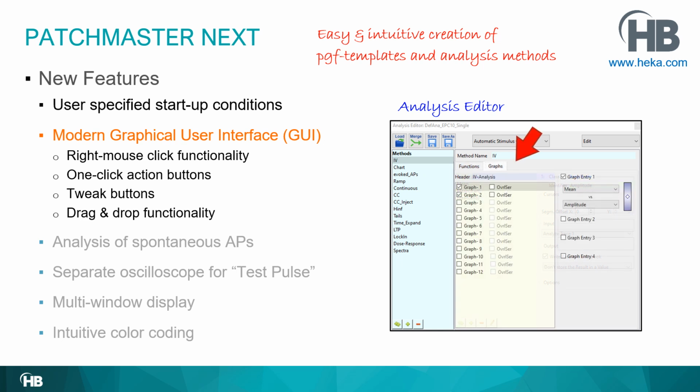Then on top, the functions and the graphs tab allows you to select or to work on the functions or the graphs. So you can also change the appearance of the analysis graphs right here.